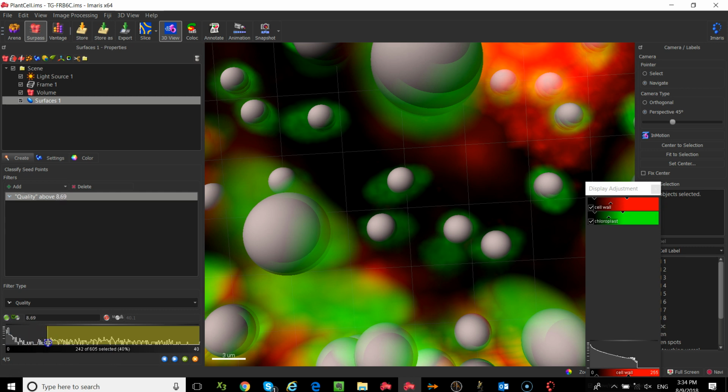The reason for that is, in some instances, if you set your sphere size too large, it overlaps the boundary of the object next to it, so the software doesn't see that there's actually another peak intensity. So it ignores it. So the solution for this is reduce the size of the sphere slightly so you don't overlap the edge of one of those structures.